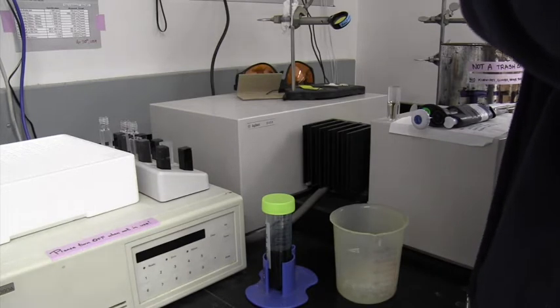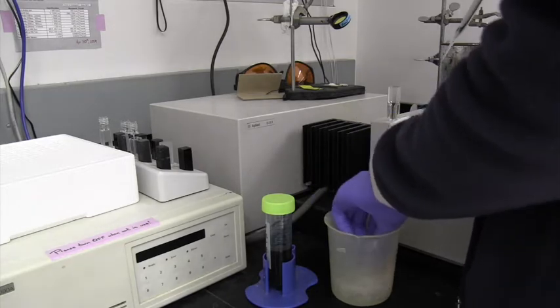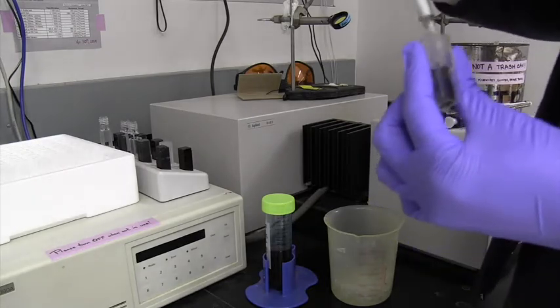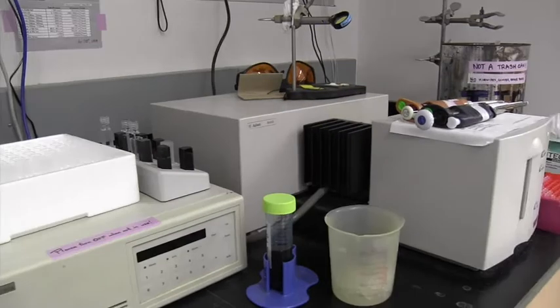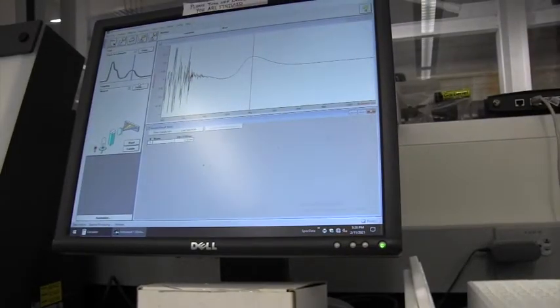Afterwards, I'm interested in seeing what the concentration of this very beautiful yellow-green protein is. So we're going to add in a small amount of our protein. This is about a thousandfold less than the initial amount of the Bradford solution. We're going to mix. See, it's actually getting a little bit darker. And we measure it. And now you can see that there is a peak. After we use a mathematical equation, we can determine the amount of protein that is in that sample.